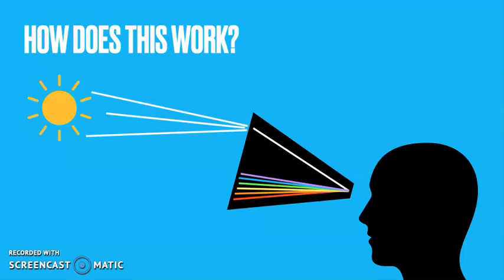This bends the light coming through it, causing the light to spread out into different wavelengths of light. These wavelengths are projected onto the screen in the wide end of the device. This screen shows a number scale that can be related to the wavelength of the light being seen.